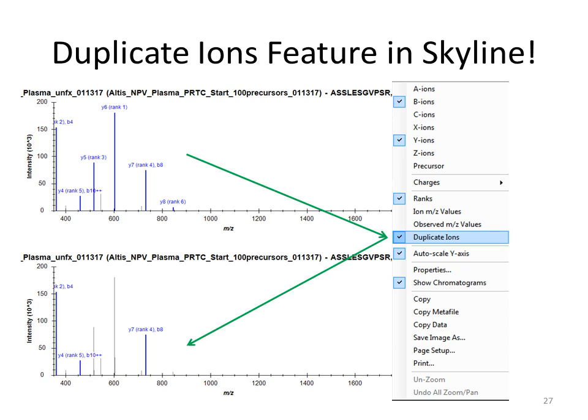with more wine. And so he enabled this thing called duplicate ions where if this is your spectral library and you have one, you click it, and when you click it, the ones that are duplicate ions that are going to potentially cause problems are shown. So you can go into your list and delete them, or mark them as potentially bad.